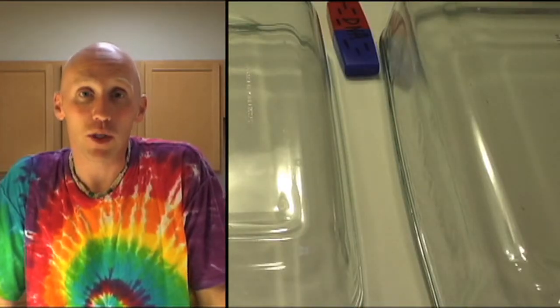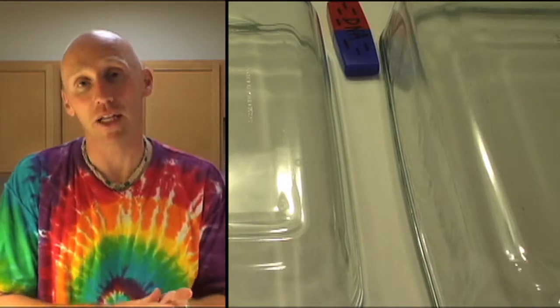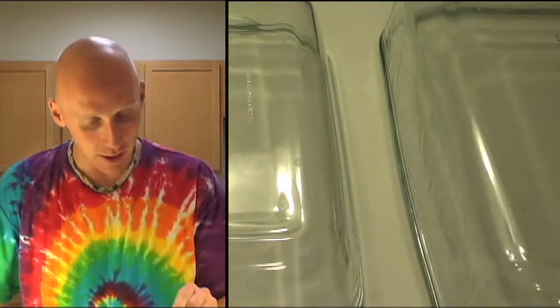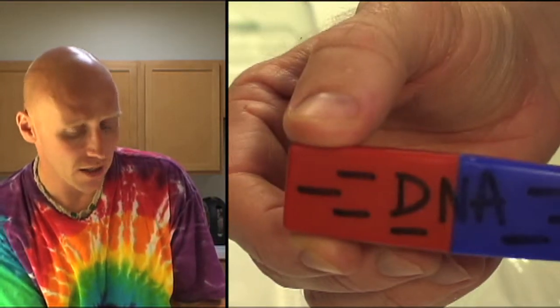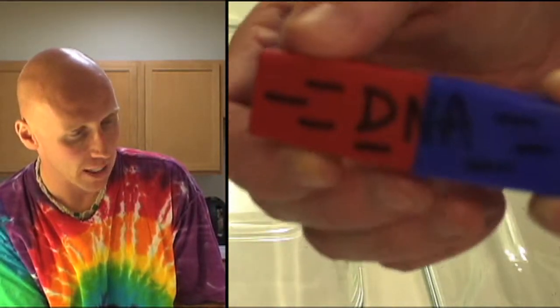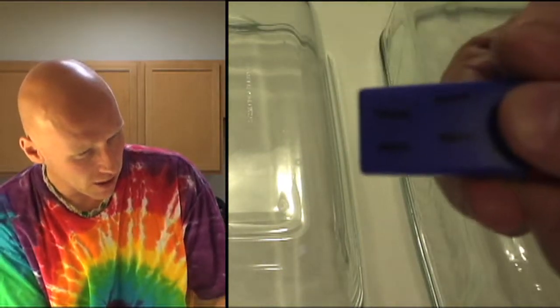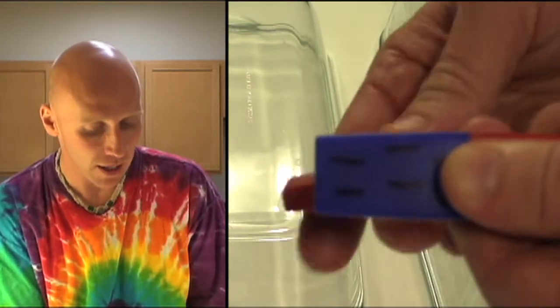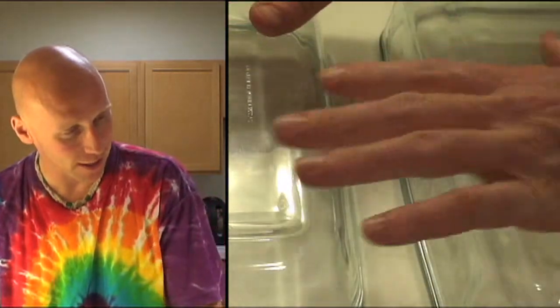While the gelatin is cooling in the fridge, I want to give you a really simple demonstration as to the principles behind gel electrophoresis. So here I've got a couple of magnets, and one of these magnets is going to represent DNA itself. Because of the sugar phosphate backbone, it is negatively charged. Here we have a magnet that's going to represent the electrical field that will be behind the DNA itself, and where this DNA is actually going to run, we've got demoed as this example.